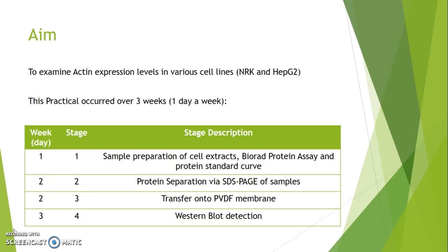A fifth stage could be performed if the equipment was present. An example of what could be performed is semi-quantitative analysis of protein bands using computer-based programs such as densitometry.